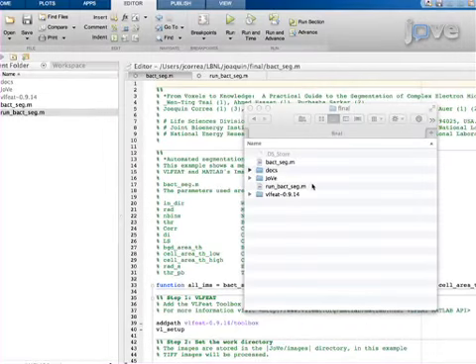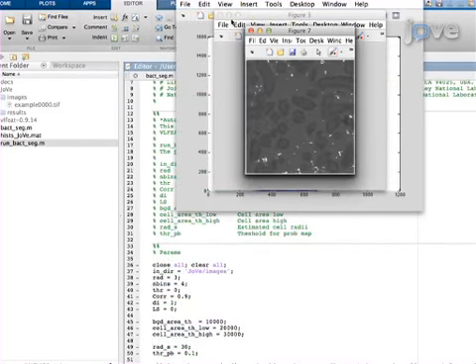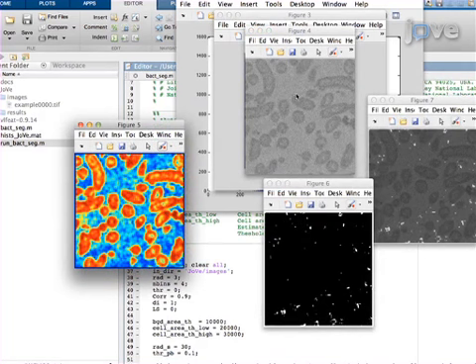A fourth approach, custom-tailored automated segmentation, can be used to efficiently segment large datasets, but requires knowledge in programs such as MATLAB. Please refer to the supplementary video on custom-tailored segmentation for step-by-step instructions on this method.